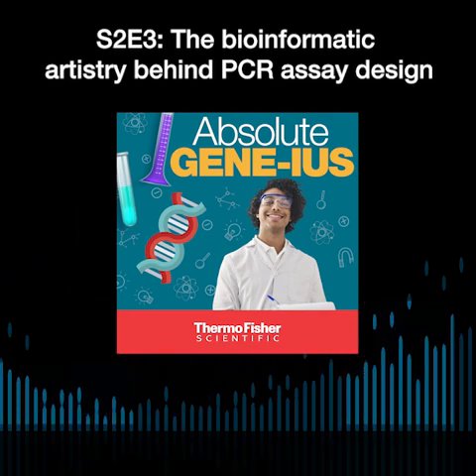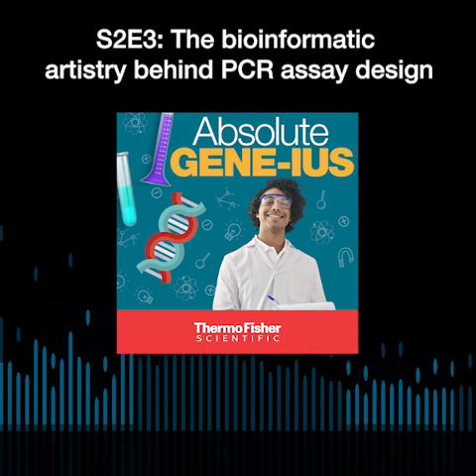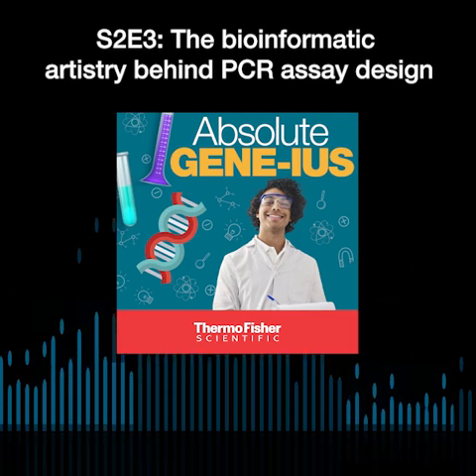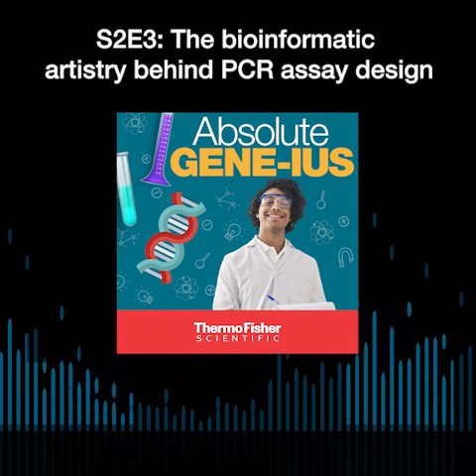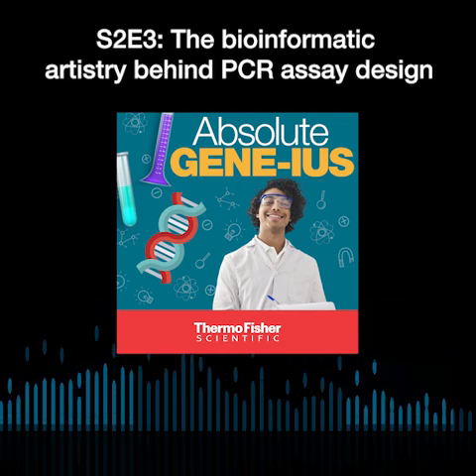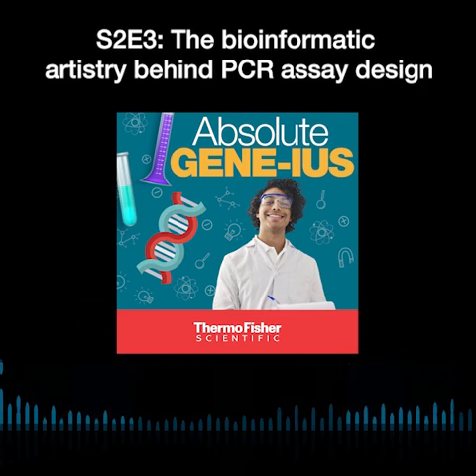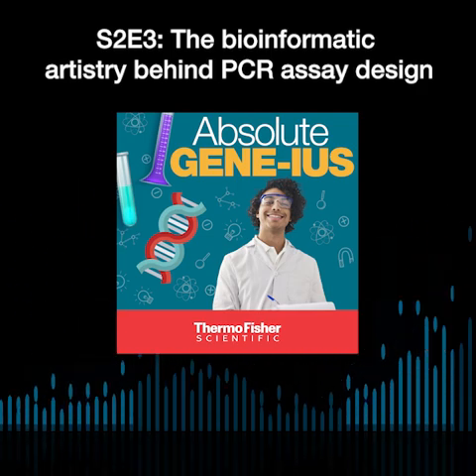Yeah, I can reiterate some points that I mentioned earlier, but I would like to add a topic that we didn't really touch on, which is the controls. Oh, yes, controls. That is a great point. Let's talk controls for sure.